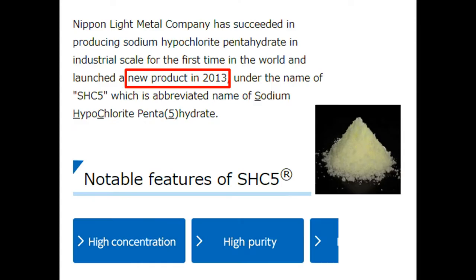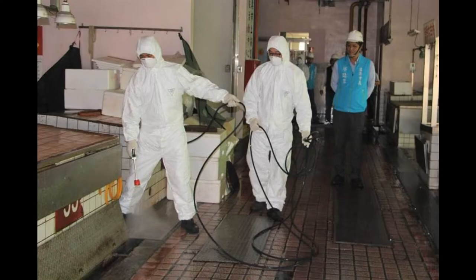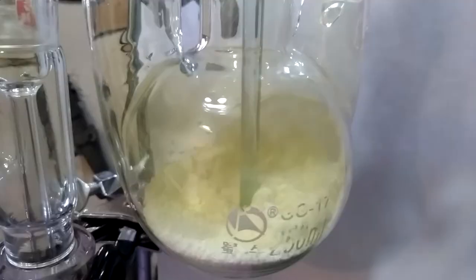It's pretty interesting that hypochlorite was found in the 18th century, yet the crystal form was only industrially available in 2013 — probably because of storage requirements and cost. The pentahydrate has to be kept in the fridge, as it will decompose at room temperature. And for most purposes, sodium hypochlorite doesn't need to be as concentrated as the crystal form; leaving some sodium chloride and sodium hydroxide in the bleach solution is much cheaper.